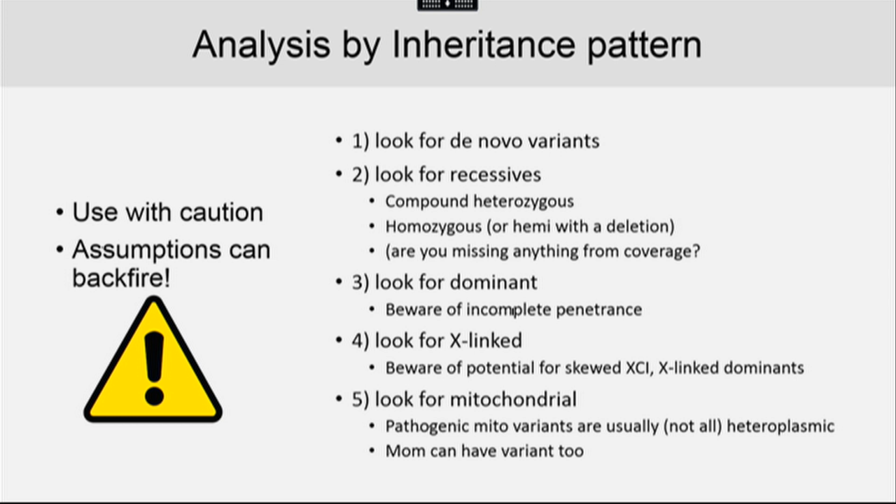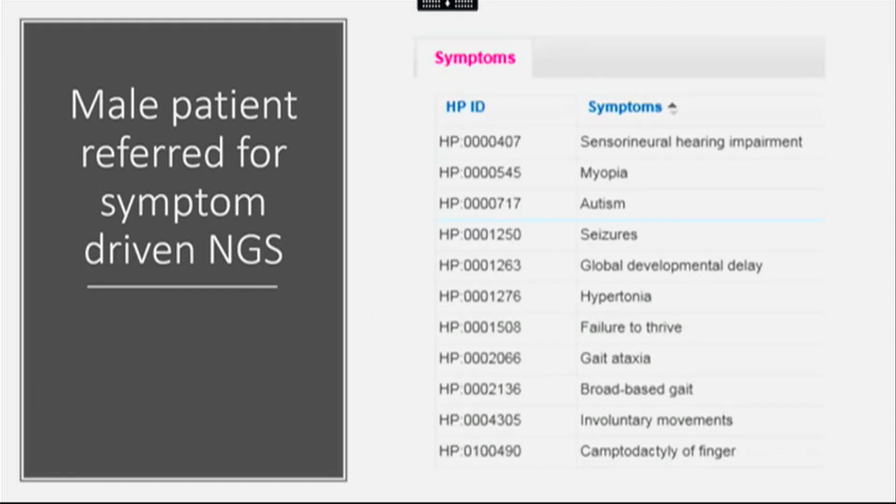We'll go through analysis by inheritance pattern again. I'm going to walk you through a couple of examples, and then my plan was to go in live and show you step by step in Viking, if it cooperates.